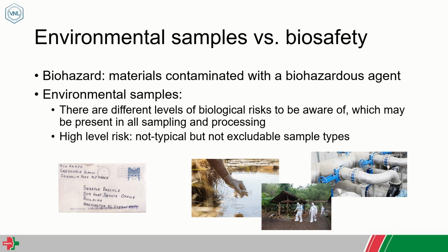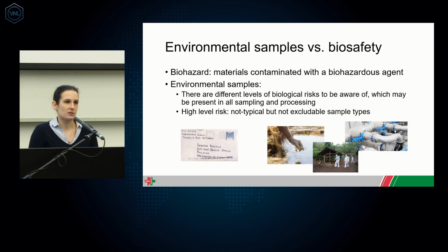For example, one can get a skin infection during sampling a poorly maintained swimming pool, or even, sadly, in the past there were deadly infections because of sampling a wastewater plant without the proper protective equipment and by an immunocompromised person. So we always should consider the biosafety perspectives also.